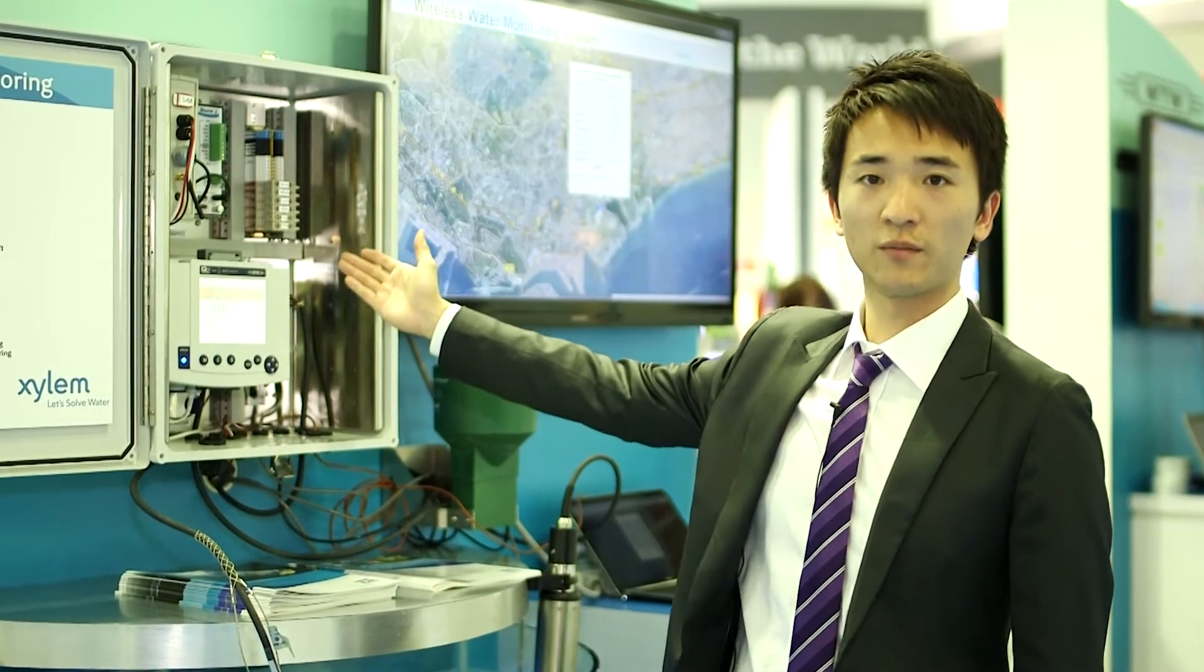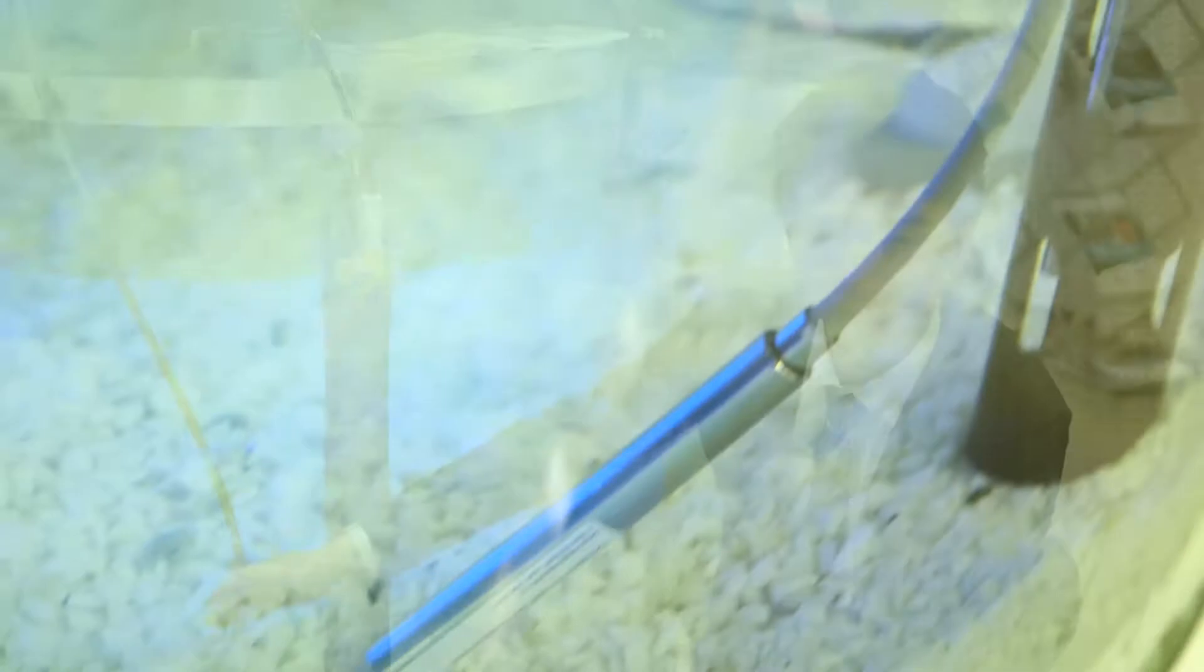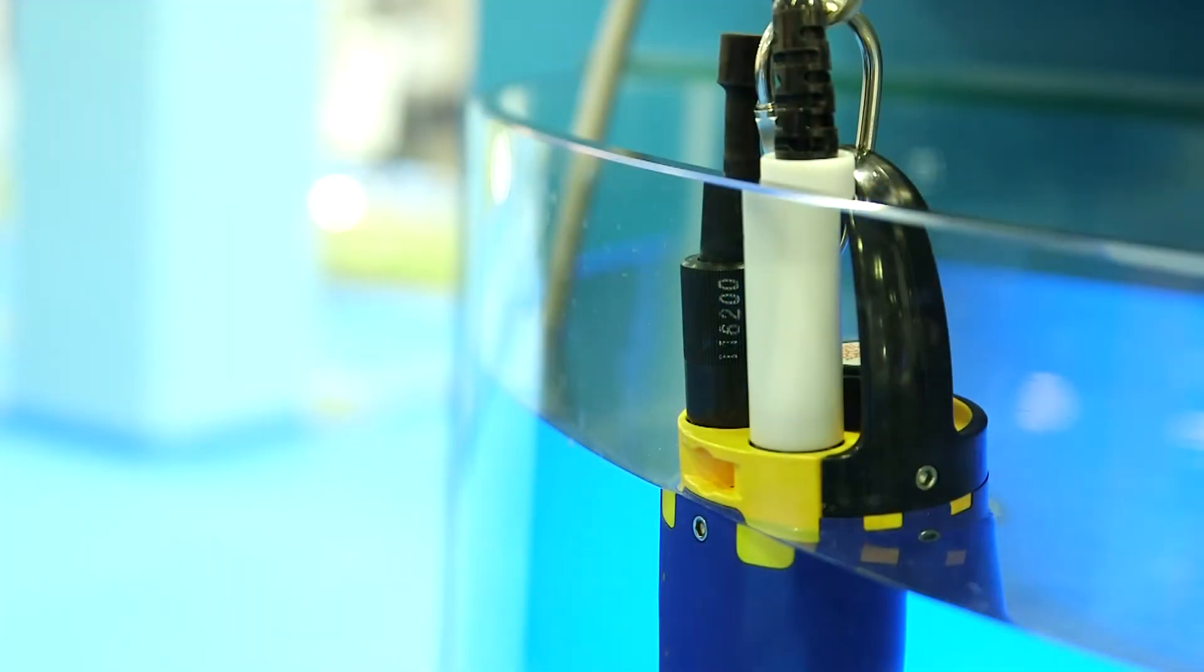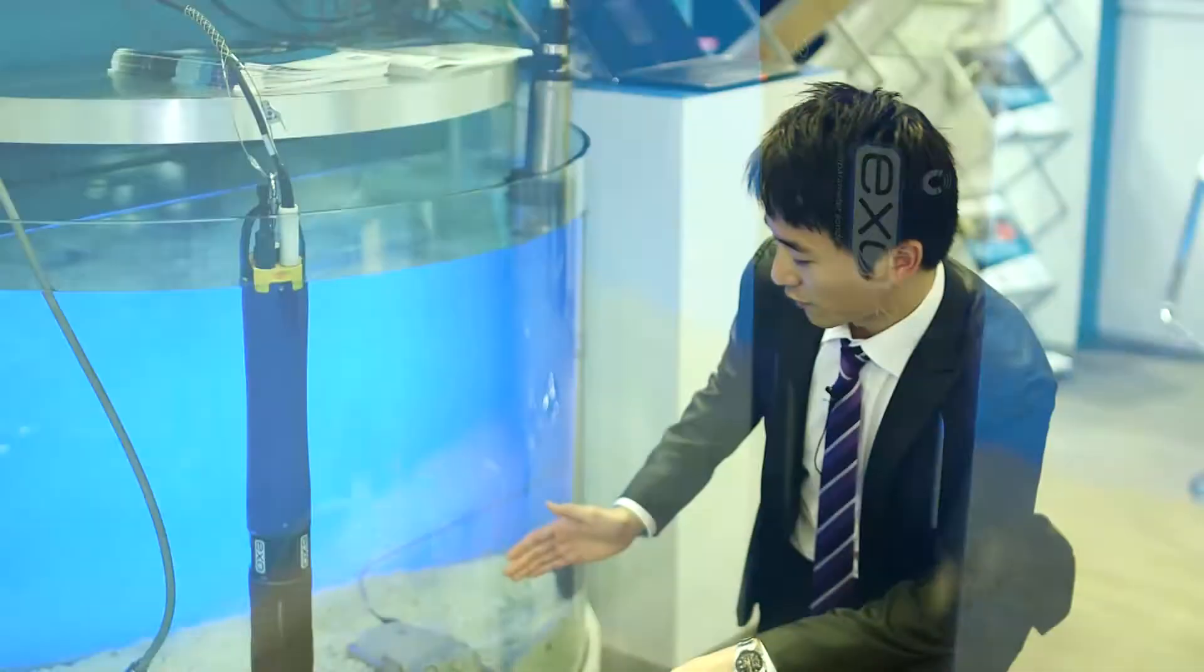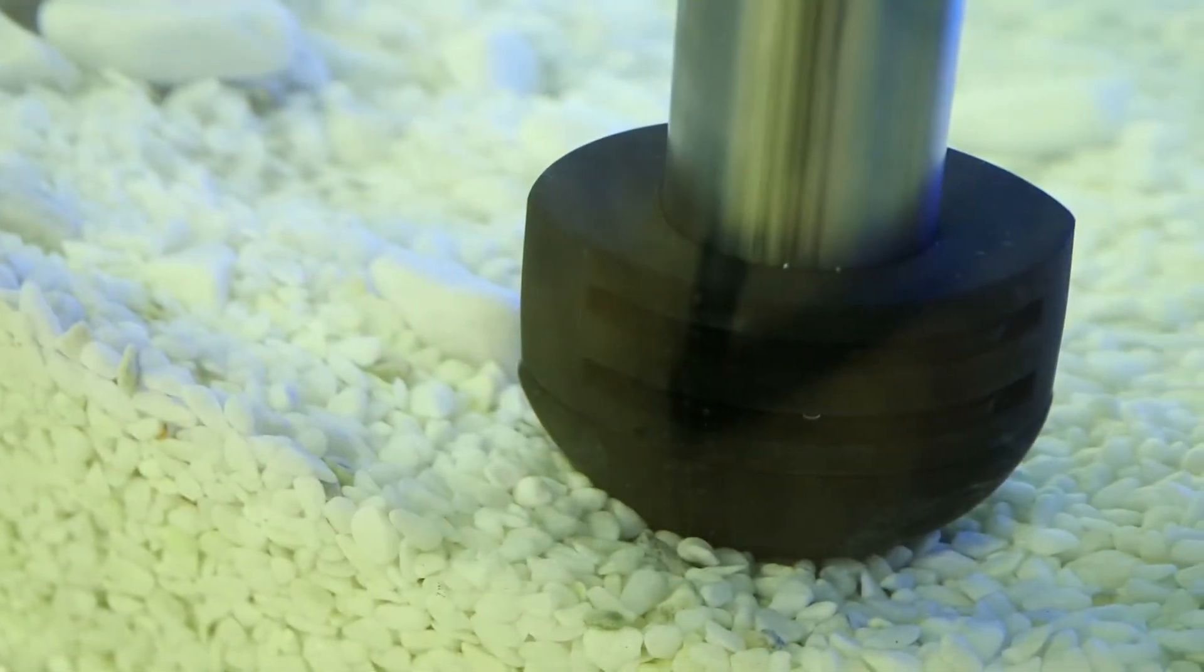So here we have a water quality monitoring station, and here as you can see we have a water level sensor, a multi-parameter instrument, and we have a water flow, water velocity sensor, and then here we have a COD sensor.